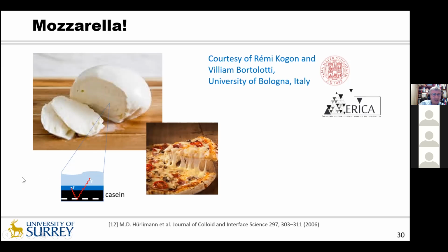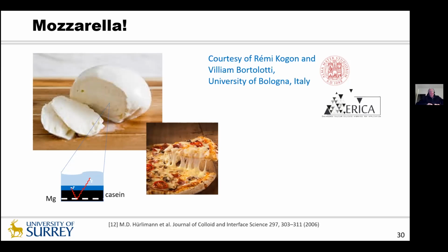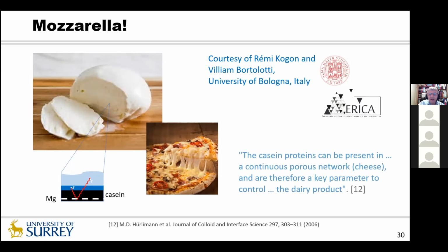Where we have casein as the protein part of the cheese being the solid, and the paramagnetic ion impurities, well, impurities, magnesium, there's a lot of magnesium in there. Their authority for doing this is a quotation from an article by a well-known name, which is presented there.